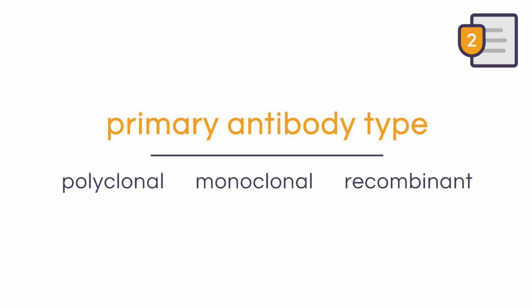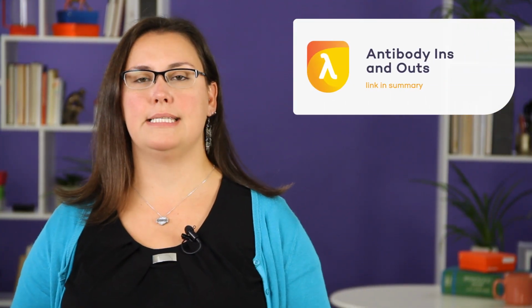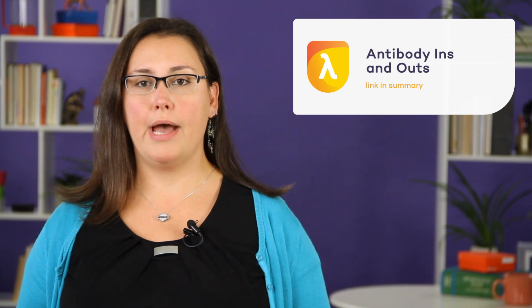Now that we know everything there is to know about the target, let's start thinking about the primary antibody itself. You will need to think about if you want to use an antibody that is monoclonal, polyclonal, or recombinant. We do have a full course on those aspects, the antibodies ins and outs, so if you have questions, please refer to that Lambda U course.